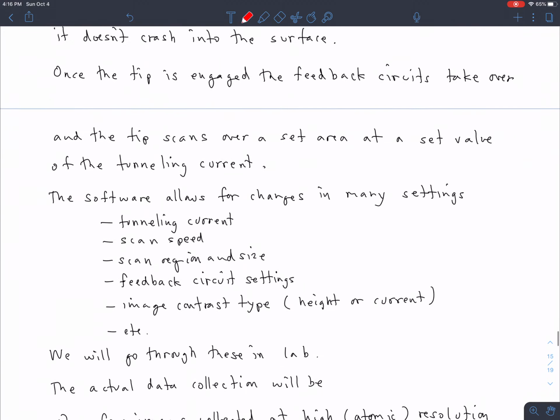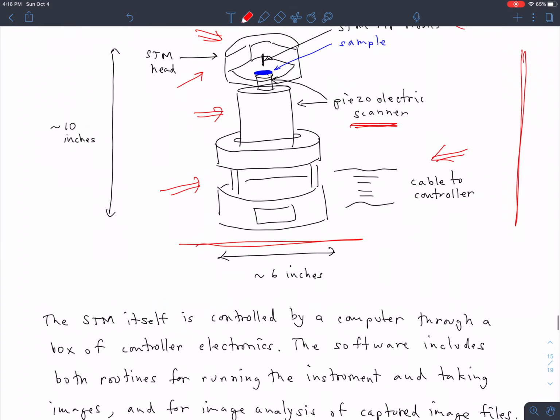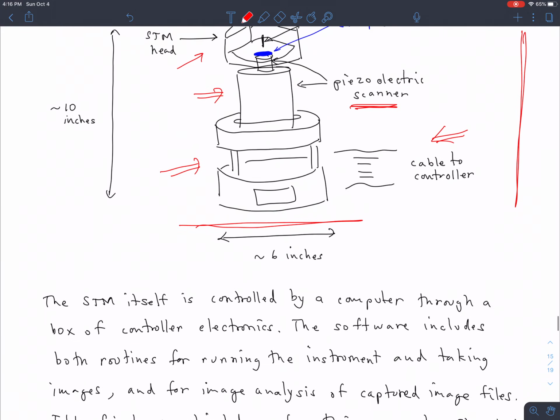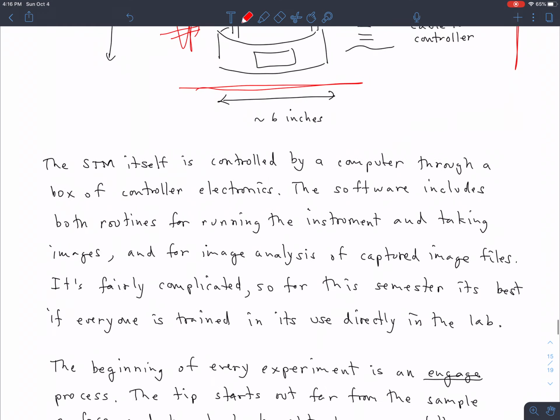All right. Yeah, there were stories that went around in the early days about graduate students assembling new STMs. These are research people, of course, whose research was STM, so they really knew what they were doing. But they would assemble a new STM while watching a football game, watching the Super Bowl back in the old days. And so it's not hard to do. Once you've got everything set up, it's really not that difficult. This is almost the opposite of a TEM, which is a giant monster of an instrument. STMs are simple, and you can make them even simpler and smaller than the one we're going to use.